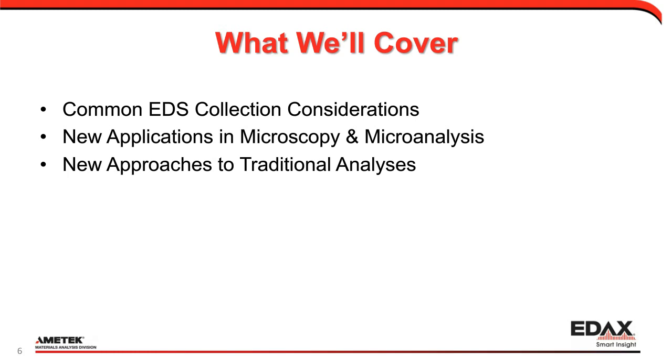At the same time, I'm addressing some of the new applications in microscopy and microanalysis that I've been seeing trending in the marketplace these days. That's quite interesting, some of the places that we're going. And also for you tried and true microscopists and microanalysts, we have some new approaches to traditional analyses. So even if you've been doing the work for many, many years, we can propose some new approaches.